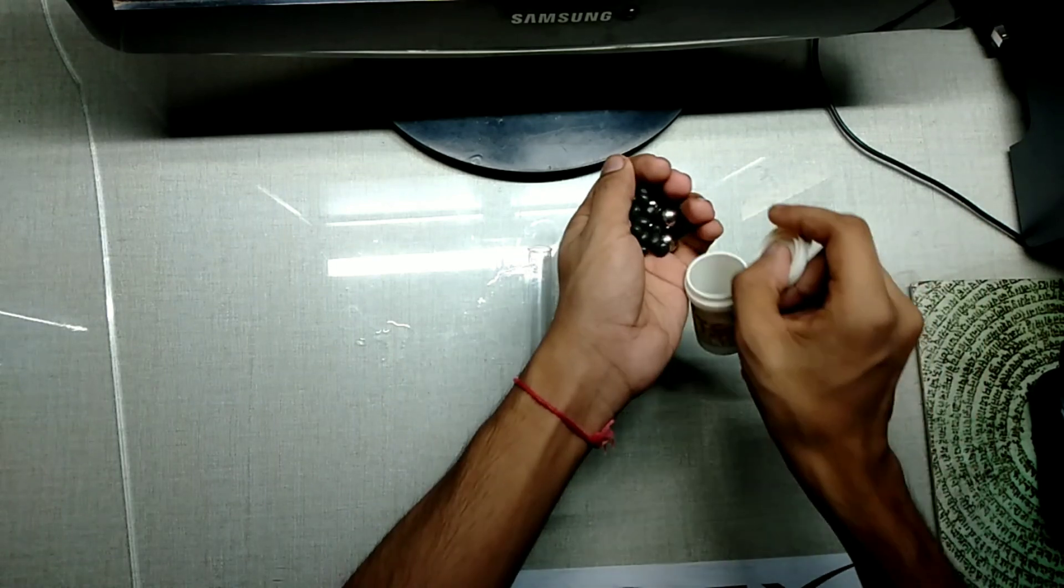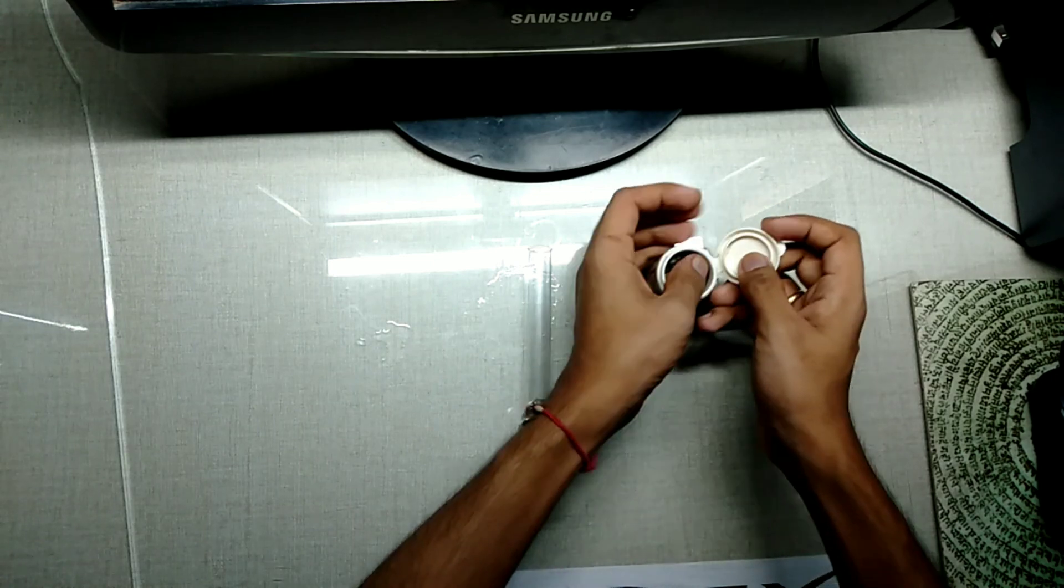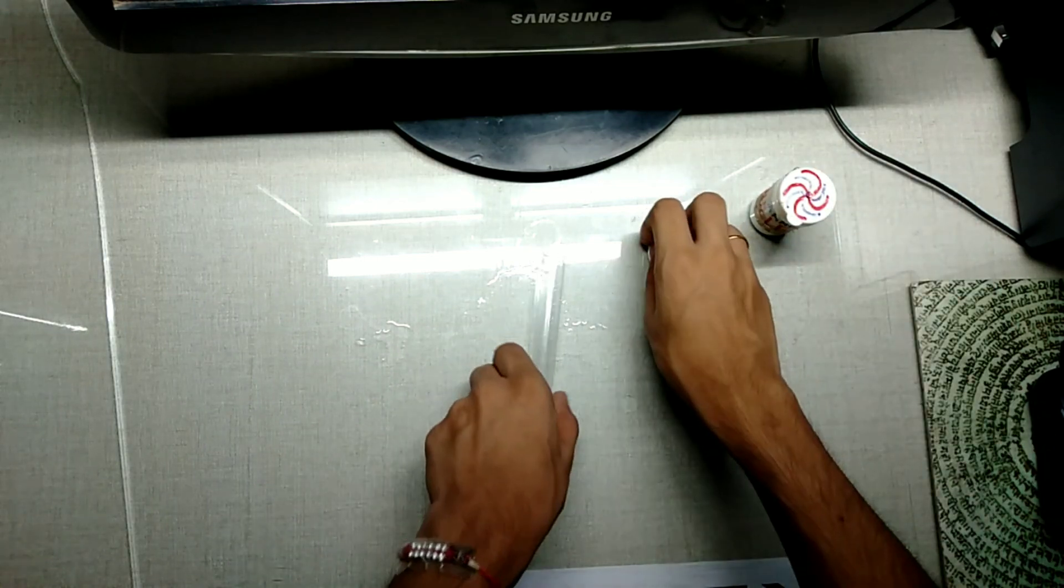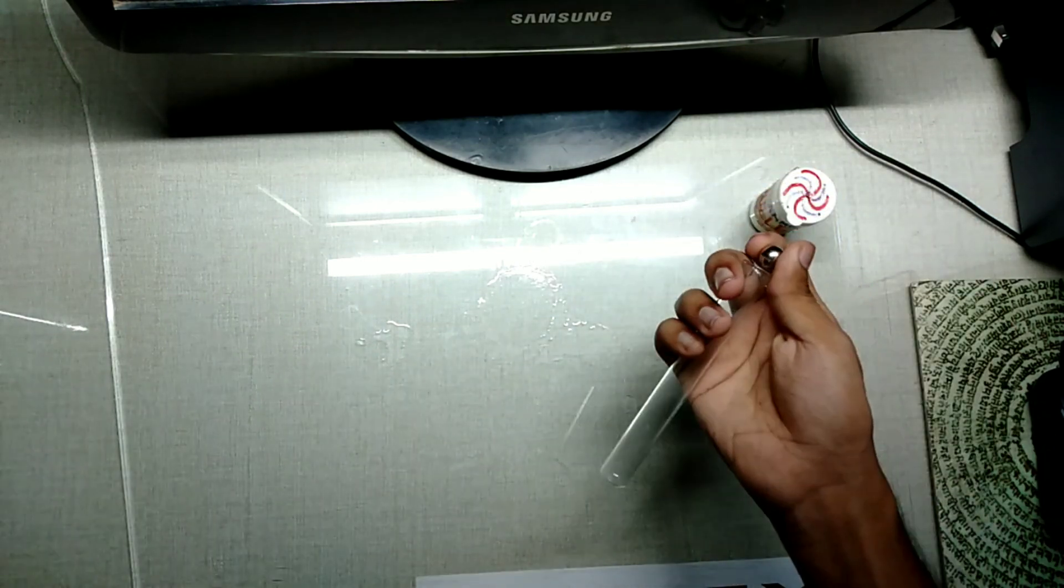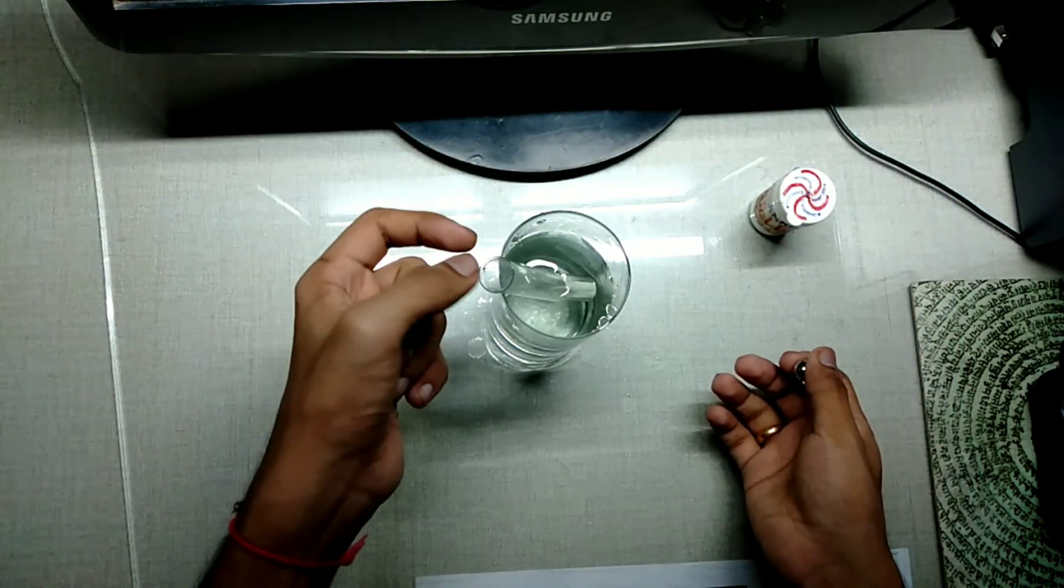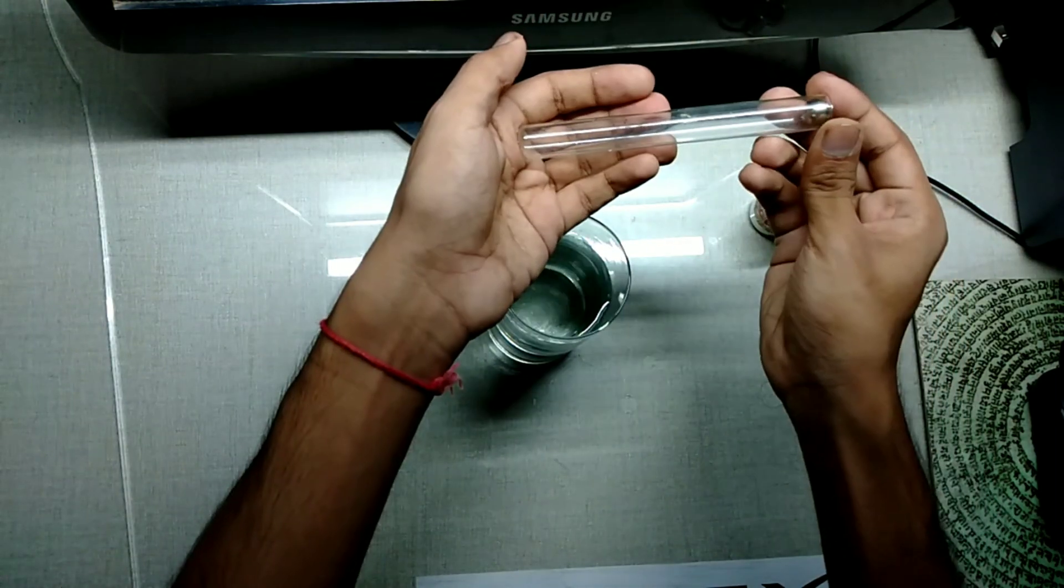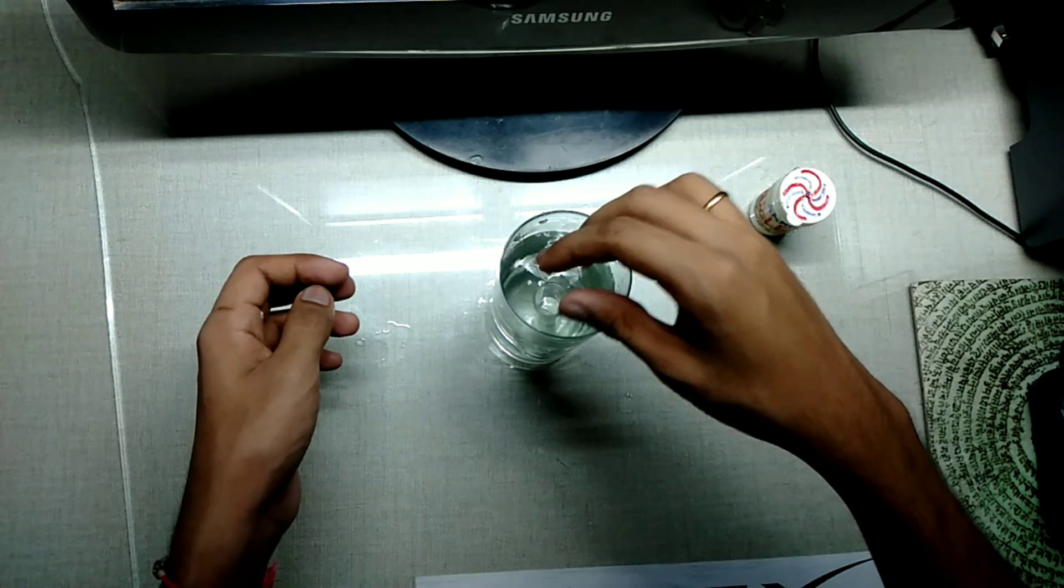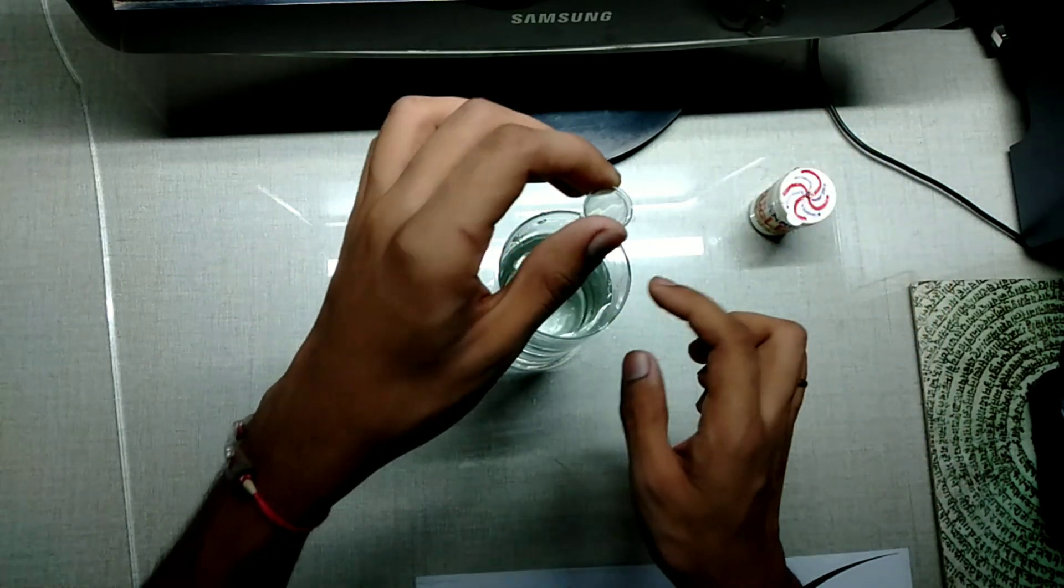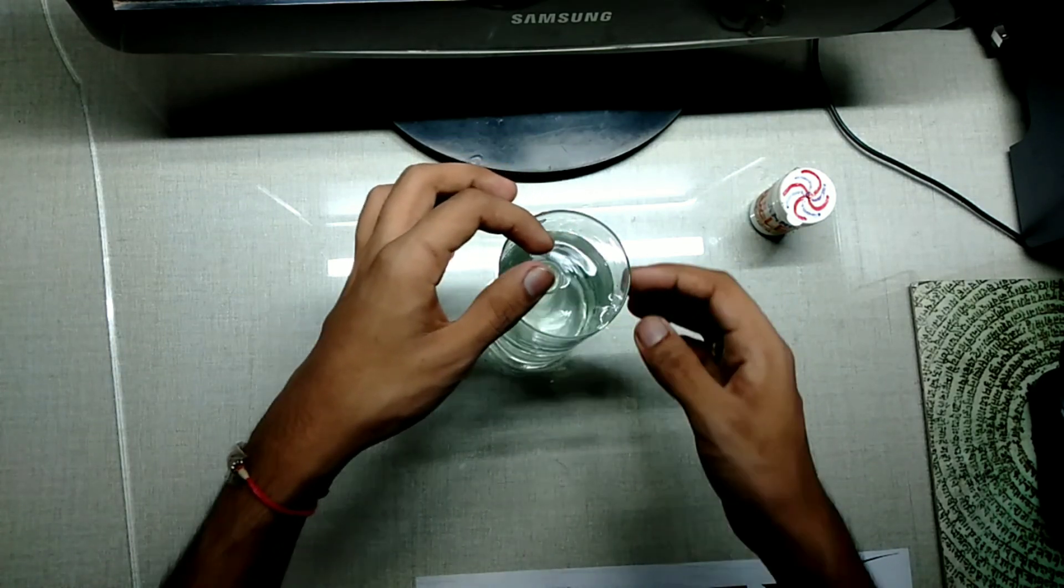So the concept is that if I don't add the weight to this test tube it will just float because of the air inside it. So what I need to do is add a little bit of weight. Okay so as you can see the weight is too much for the test tube to float in the liquid because it is just sinking down.